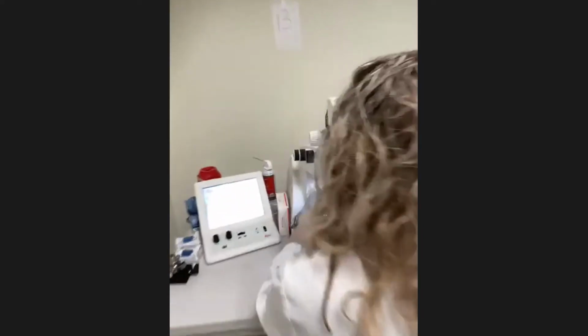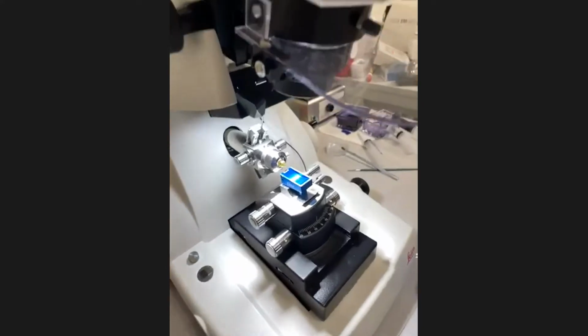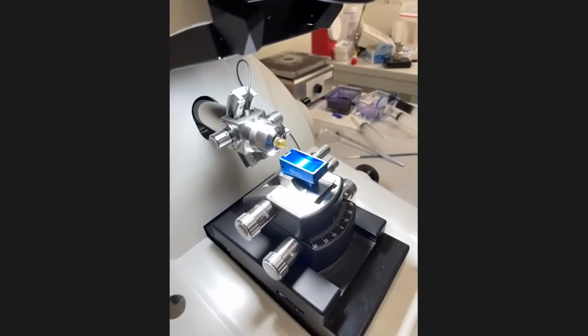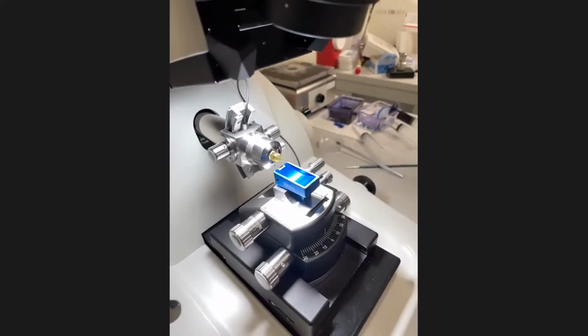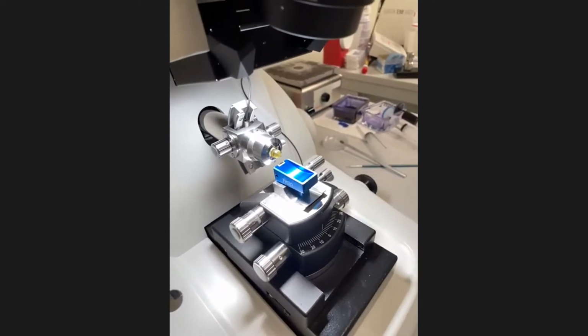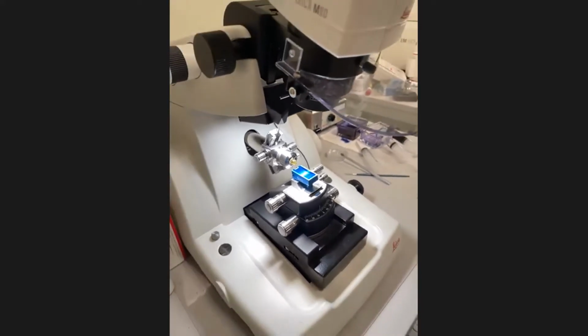We cut on this bath right here, this blue thing. It's got water inside. It's called a water bath. Like the one we used up in light microscopy, this one is much smaller. And there is a blade on the edge. It's actually a diamond knife, and that's what we use to cut the tissue into these tiny pieces.